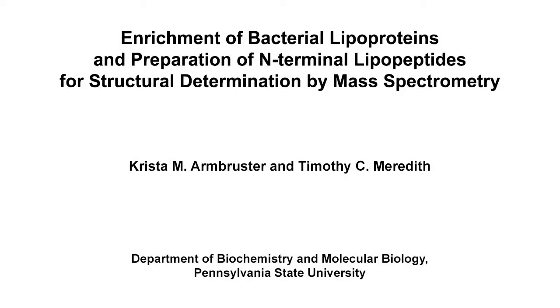The overall goal of this procedure is to extract lipoproteins from bacterial cells for direct applications, and to further prepare N-terminal lipopeptides for structural analysis by MALDI-TOF mass spectrometry.